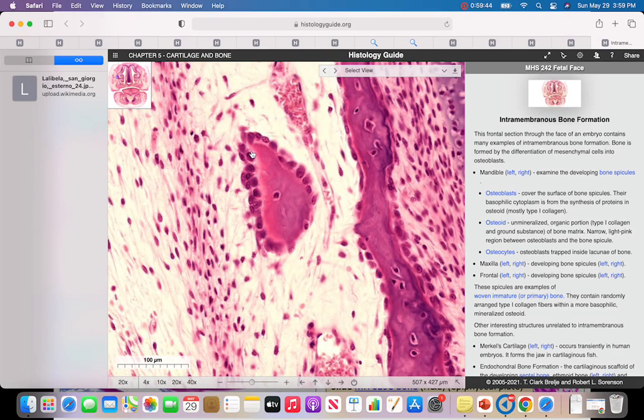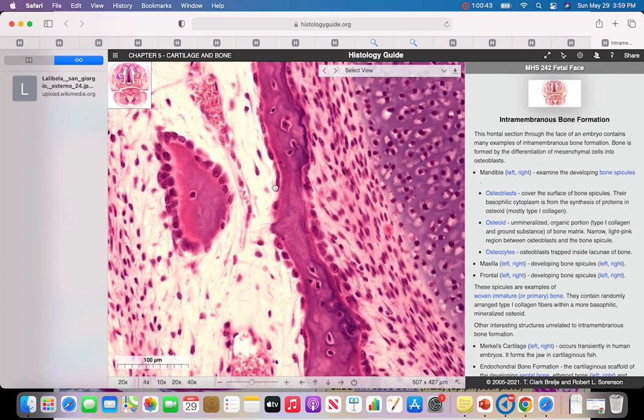So these are active osteoblasts, which are cuboidal. And these active osteoblasts produce matrix. And gradually, some of these osteoblasts will be surrounded by the matrix and they become osteocytes. And as you know, osteocytes will maintain the matrix. Or you can see it here. These are active osteoblasts, which lay down new bone tissue, and these are osteocytes. So such type of bone formation is intramembranous.